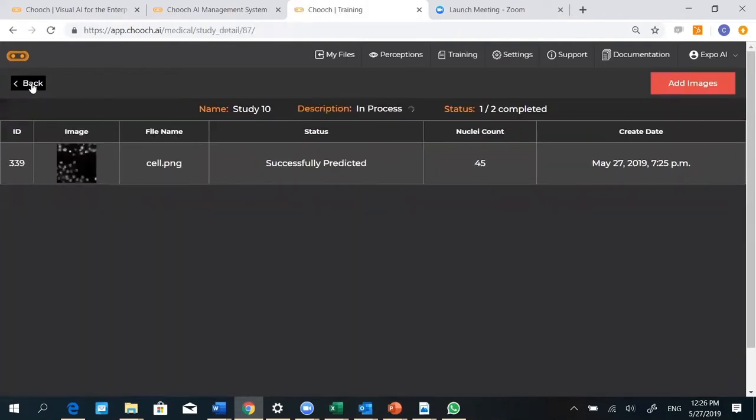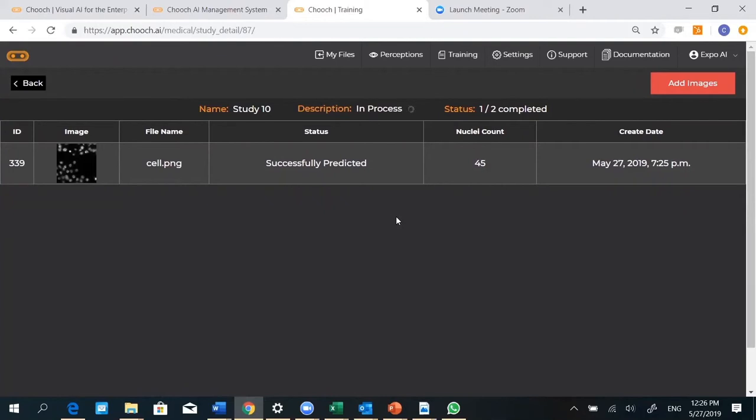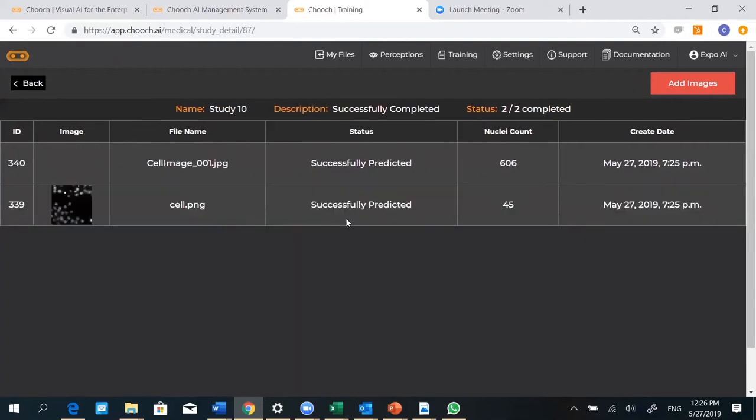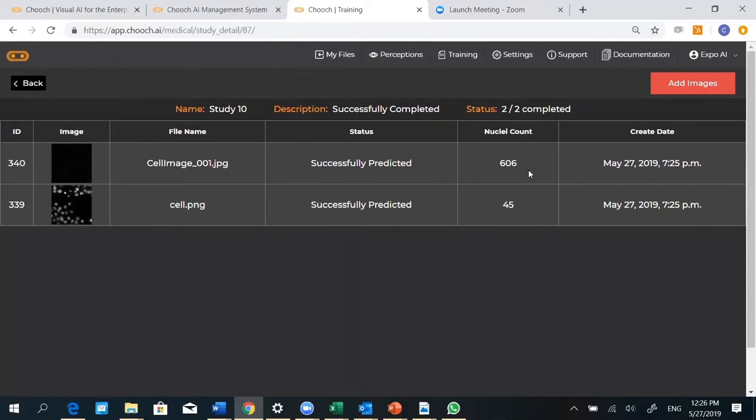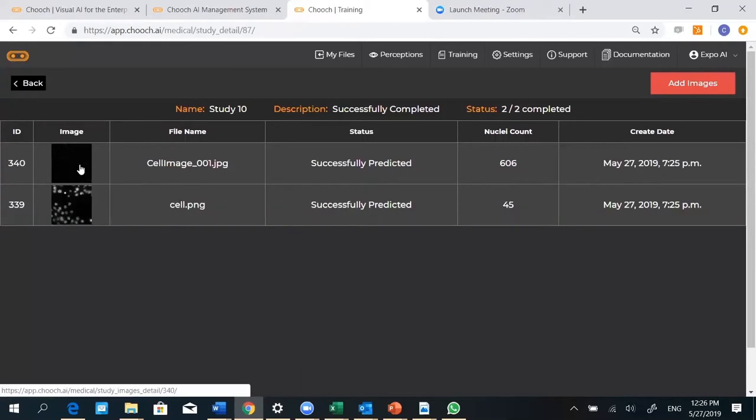Let's go back. The second image was a larger image and it's in the process of counting those as well right now. There we go. This is the second image, successfully predicted, and it has 606 nuclei in it. Let's check it out.